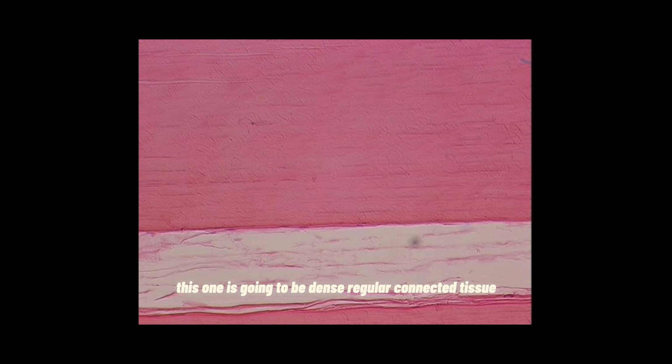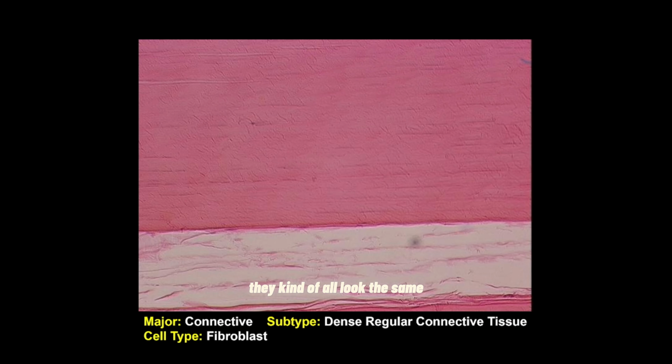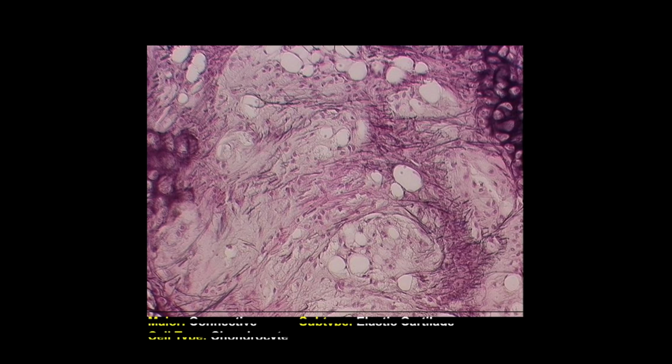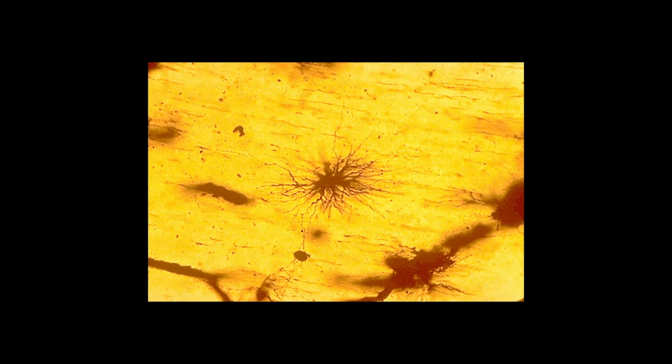This one is going to be dense, regular connective tissue. Whenever you first look at these, they kind of all look the same. And then this one is going to be elastic cartilage. This one is going to be fibrocartilage. This one's another easy one. It's going to be nervous tissue.